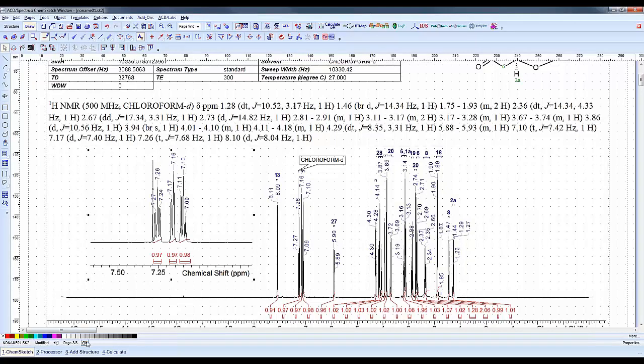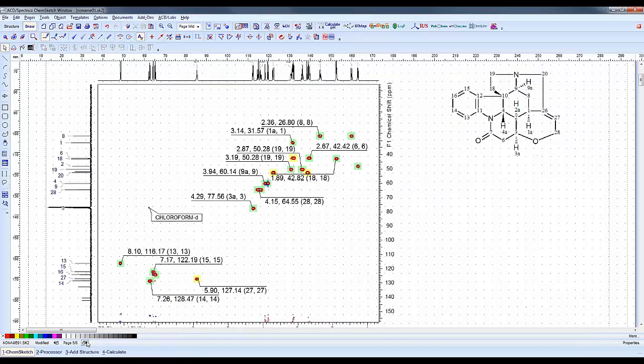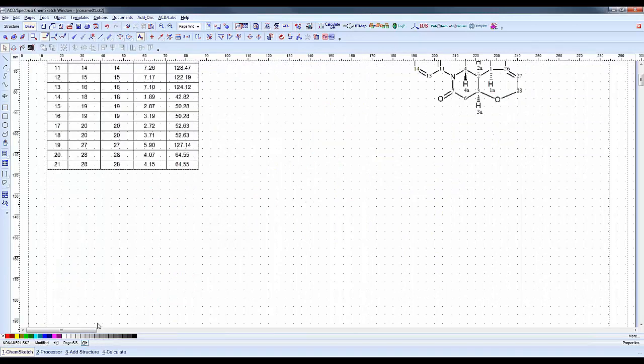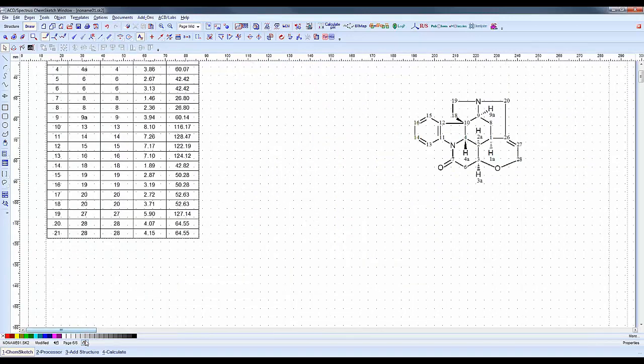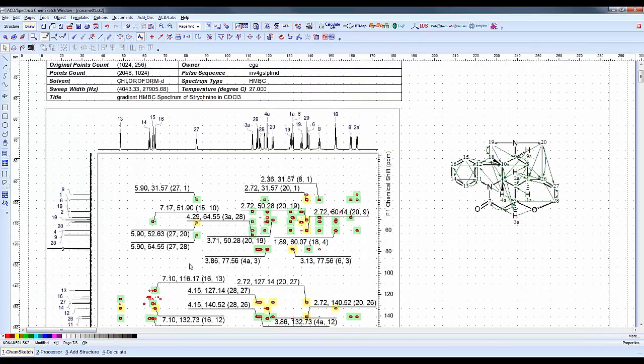We have our inset and full spectrum in the report. We have some other data - our carbon NMR, our HMQC, our assignments from our HMQC here, and our HMBC also.